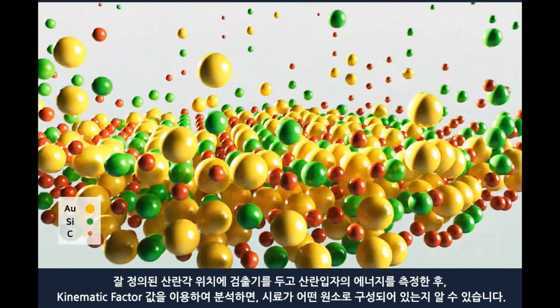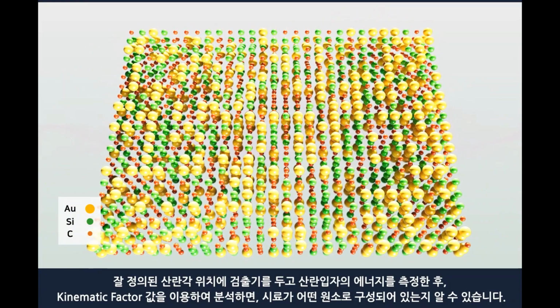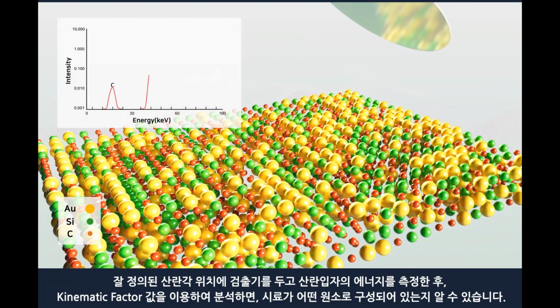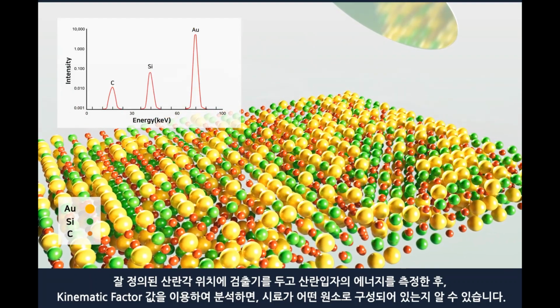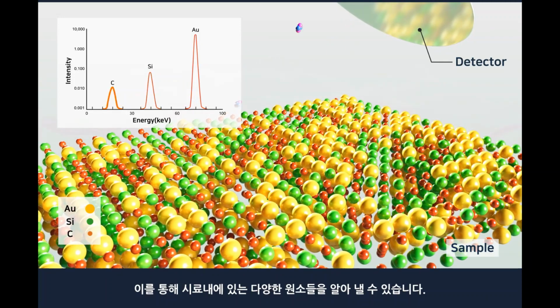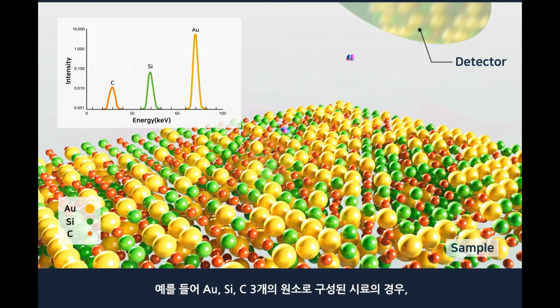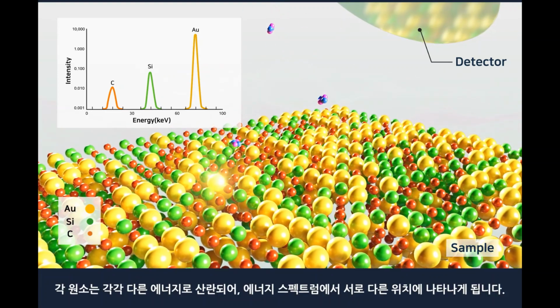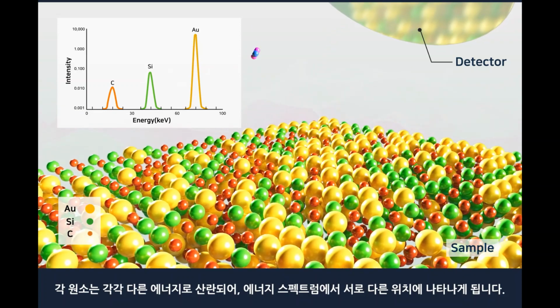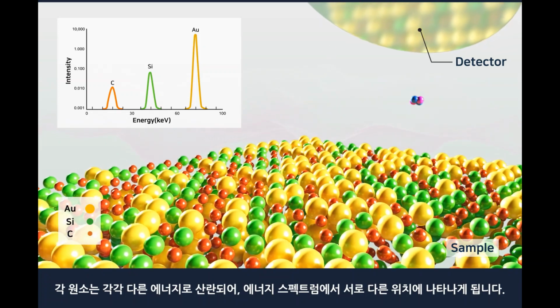After measuring the energy of the scattering particles by placing the detector at a well-defined scattering angle position and analyzing it using the kinematic factor value, the elements of the sample can be determined. This will enable us to determine various elements within the sample. For example, in a sample comprising 3 elements, ions are scattered by each element, resulting in different energies, and each spectrum appears at a different position in the energy spectrum.